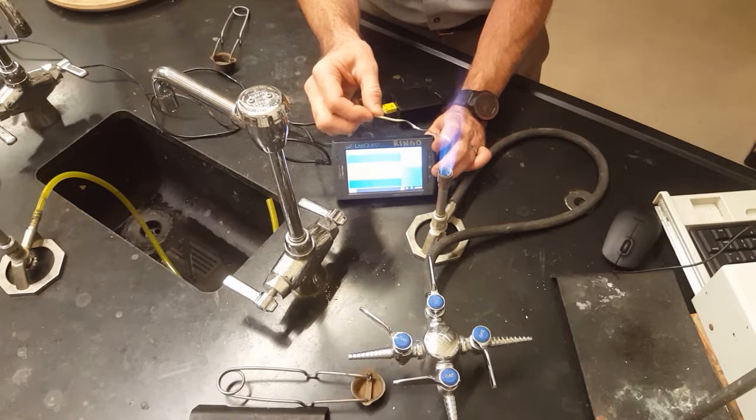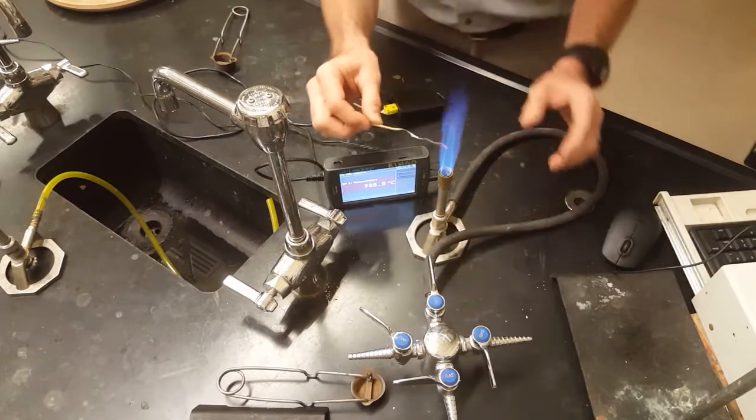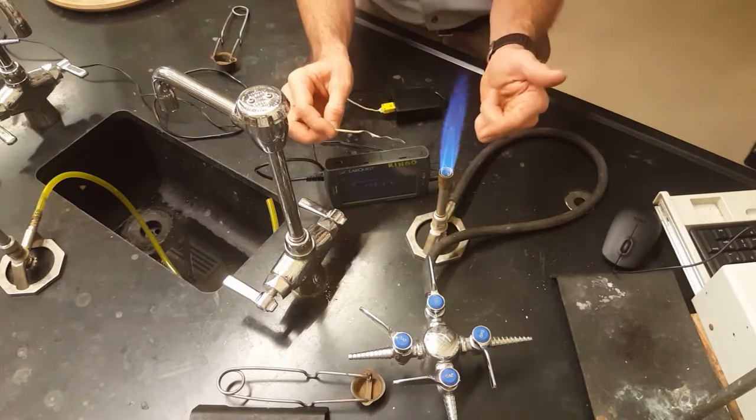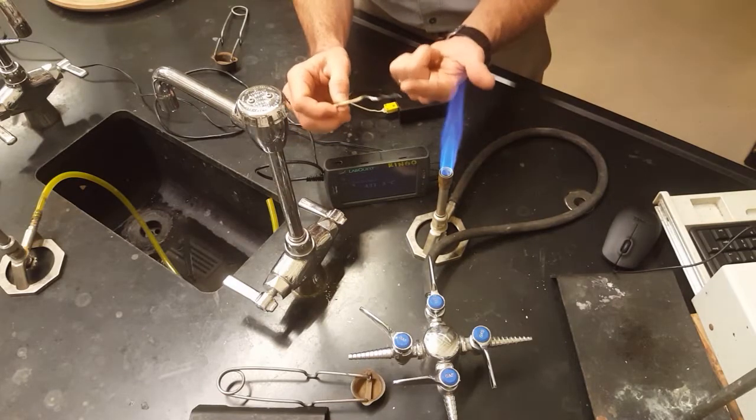Whatever you do, don't ever put a real thermometer in here because you'll melt it. The thermocouple is the only temperature measuring device we can put in the Bunsen burner flame.